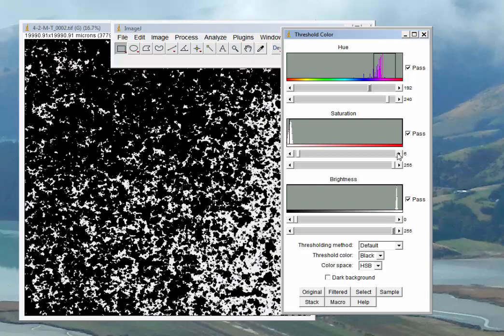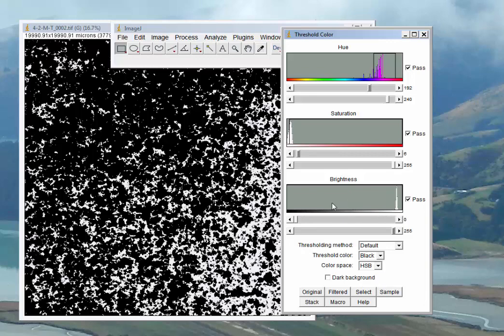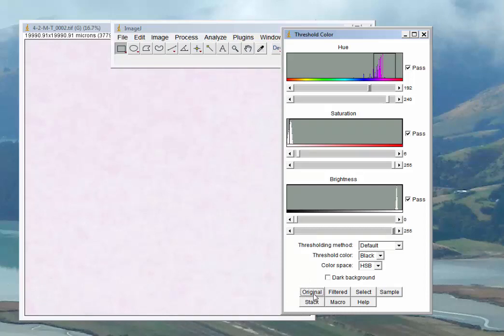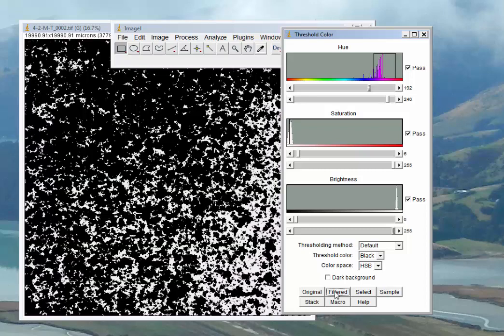We can slide the slider back and forth here. Obviously those two degrees of extra saturation eat up a lot more coverage. Our brightness passes are always 0 to 255 because any pixel of any brightness with a color in it we want.